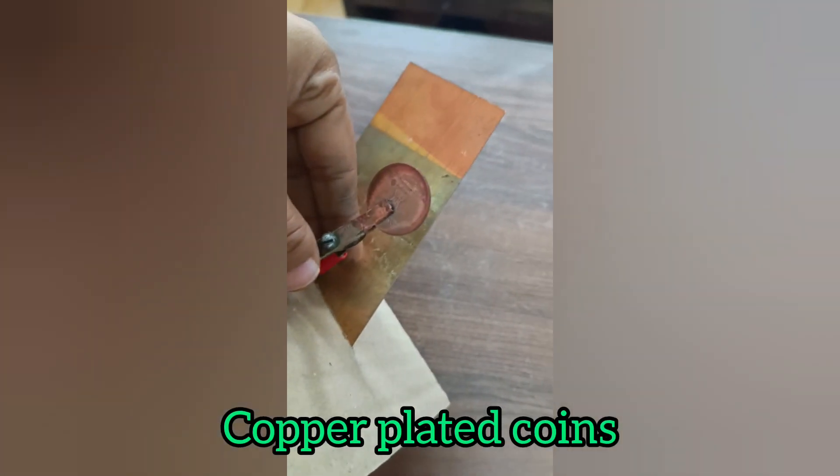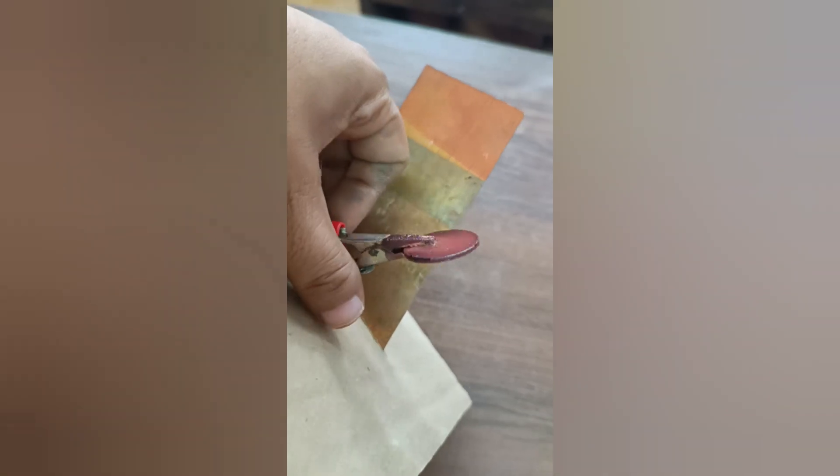Electroplating is usually done with chromium, tin, silver, gold, or copper metal. As you can see, we have coated copper metal over this metal coin.